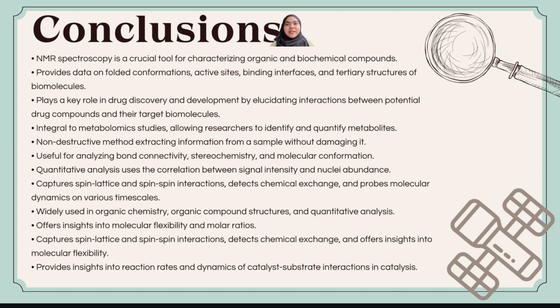NMR plays a key role in drug discovery and development by elucidating interactions between potential drug compounds and their target biomolecules. It's integral to metabolomic studies, allowing researchers to identify and quantify metabolites. It is also a non-destructive method, extracting information from a sample without damaging it. NMR is also useful for analyzing bonds, connectivity, stereochemistry, and molecular conformation.